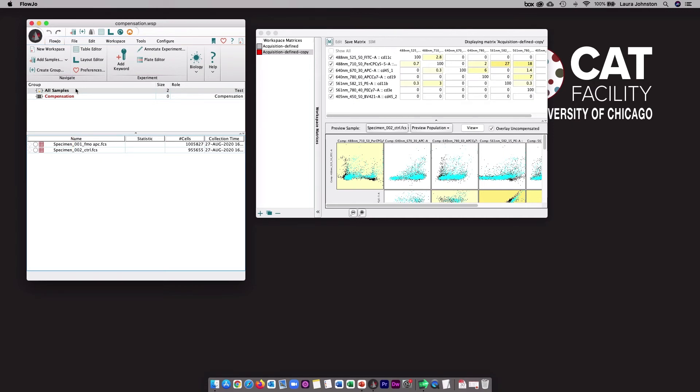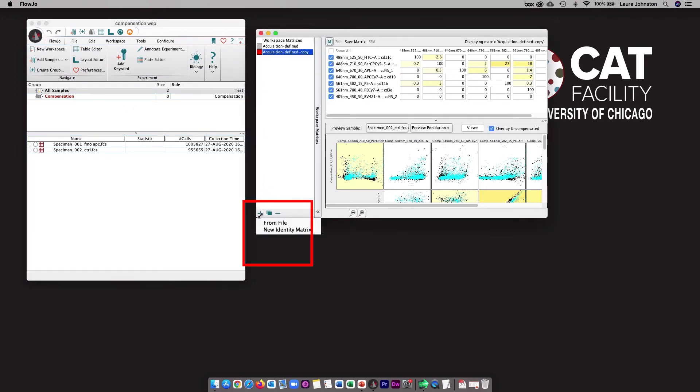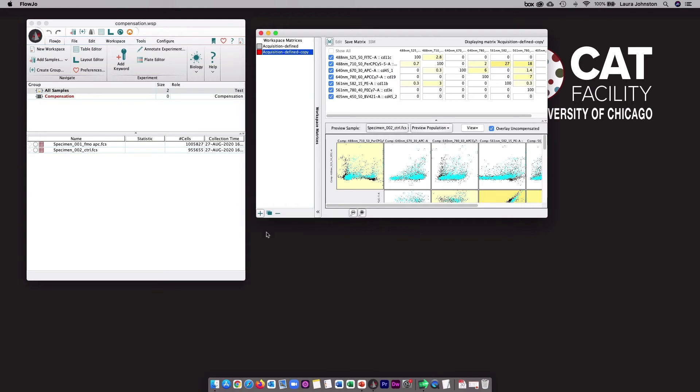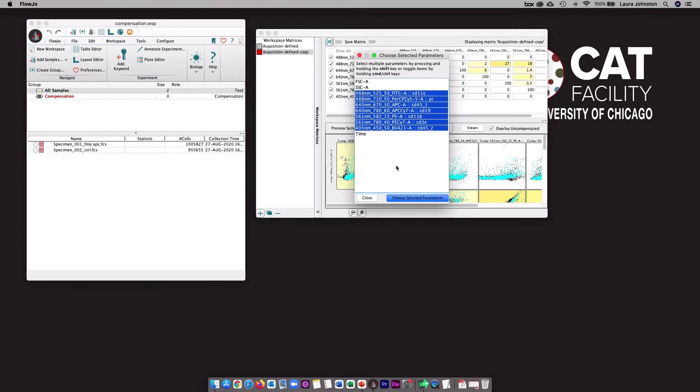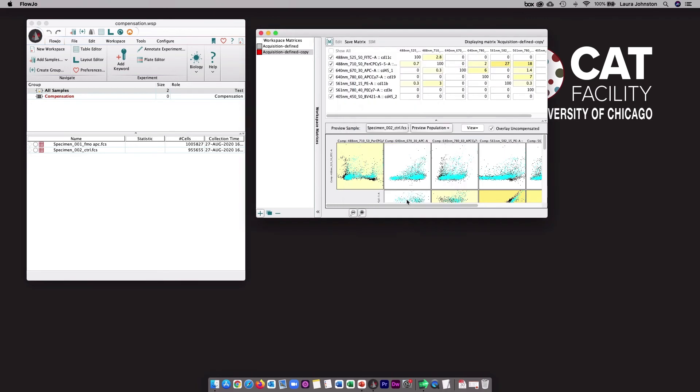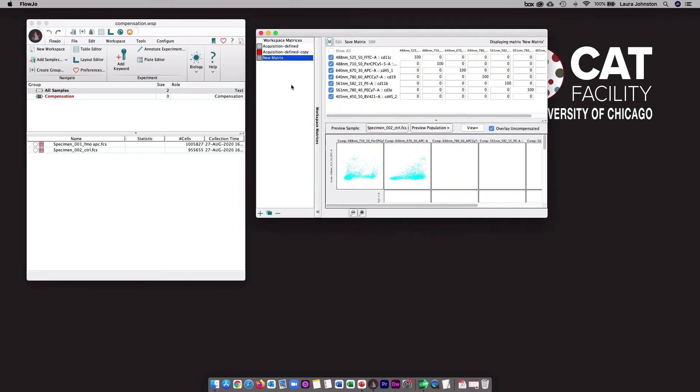If you instead want to start from scratch, there's a couple of options. You can make a brand new empty matrix by clicking on this plus button here and then new identity matrix. You'll select the parameters you want to use, and that will generate a new matrix that has no values inside of it.